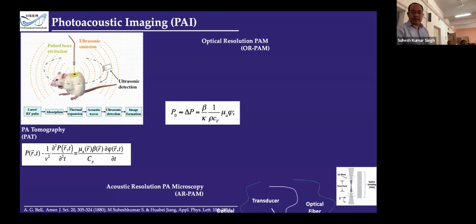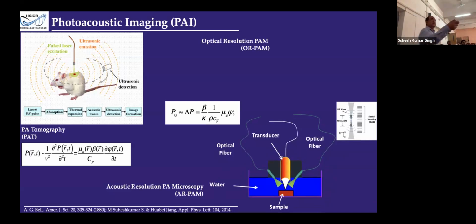And then in photoacoustic microscopy, the expanded beam is used, and tightly focusing ultrasound transducers are kept around here. Over here, it is not a focusing transducer; we may use it, but not necessarily. If we are focusing with these transducers, then we collect a time-resolved signal enabled by the data acquisition system, along a line, that is the 1D time-resolved signal. In this way, the obtainable spatial resolution is controlled by the spot size of this focusing transducer.